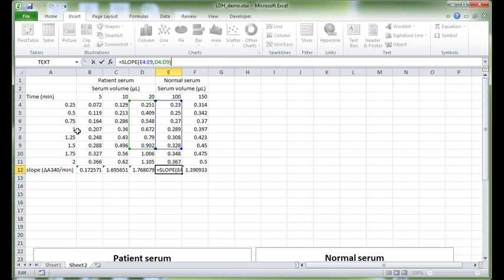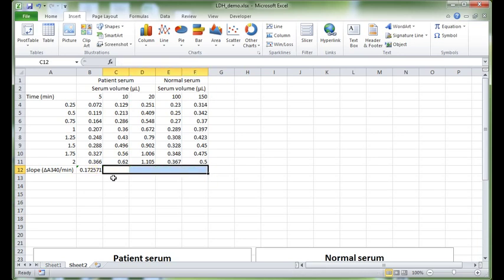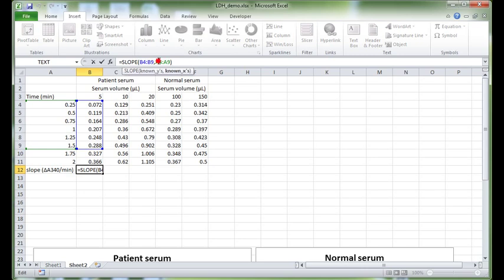In order to get Excel to keep the green box static, we can use something called absolute referencing. So let's delete these incorrect formulas and go back to our correct one here. Absolute referencing tells Excel, when I click and drag, do not change particular references. You can see the A4 to A9 reference, we want Excel to keep static. In order to get Excel to keep it static, we can put a $ in front of the letter as well as the number.